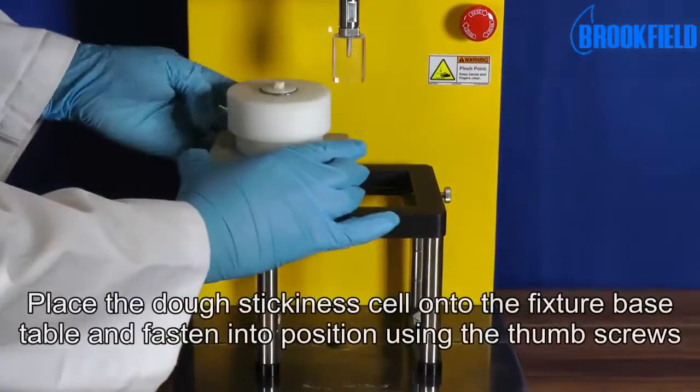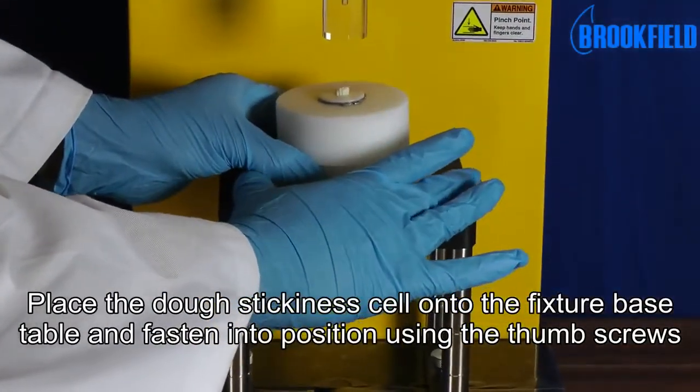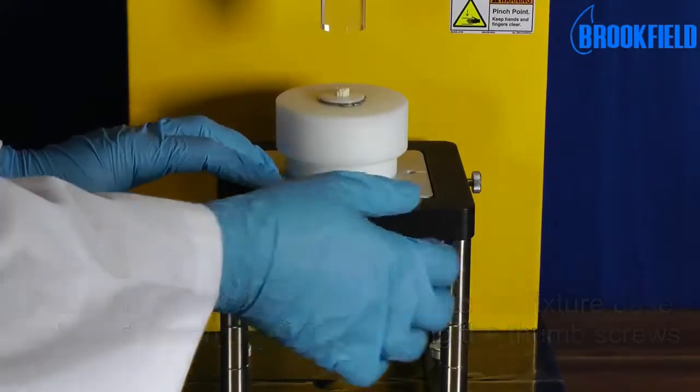Place the dough stickiness cell onto the fixture base table and fasten into position using the thumb screws.